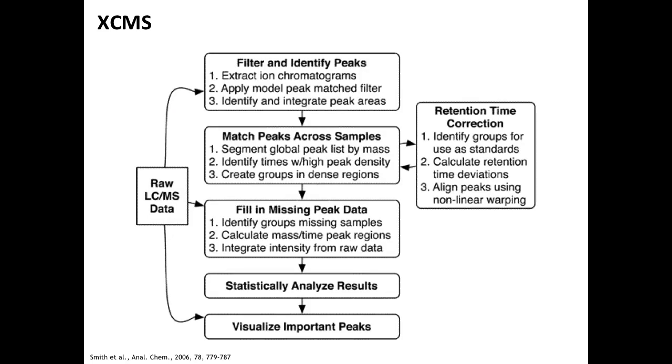That works reasonably well. There are a couple other things that are being used: filling in missing data, matching across samples, retention time correction. You see they do it in a slightly different way, a slightly different order than we do it. And since it's all embedded in R, it is very convenient to also do the statistical analysis in R, whereas in OpenMS, you either embed your R code into KNIME, or at some point you just export it into R and go from there.